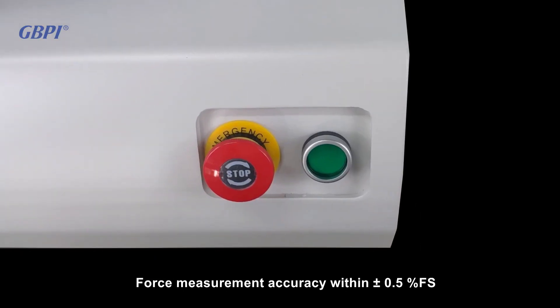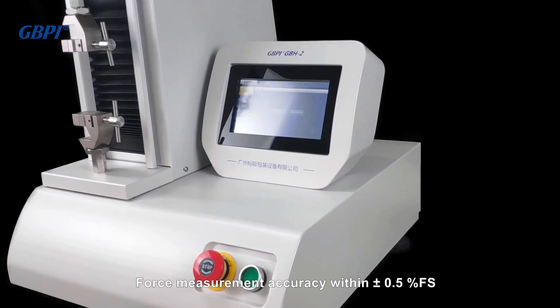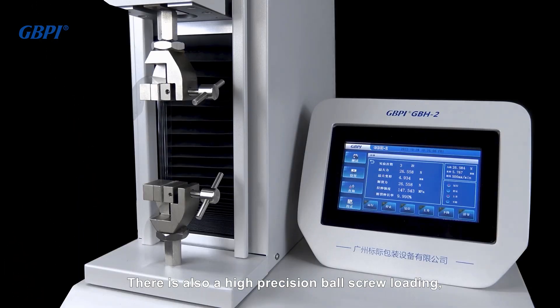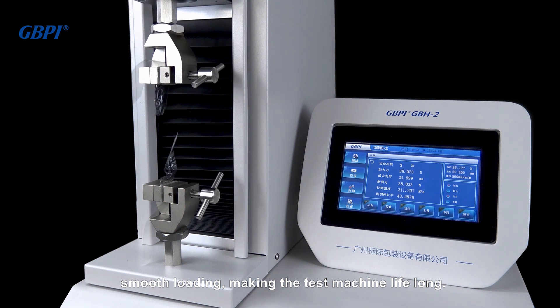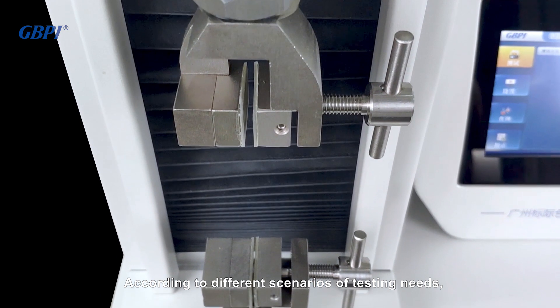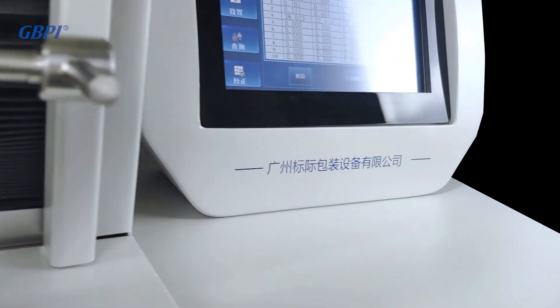The use of high precision sensors ensures force measurement accuracy within plus or minus 0.5% FS. There is a high precision ball screw for smooth loading, ensuring the long life of the test machine. Corresponding fixtures and pneumatic fixtures can be customized according to different testing scenarios.